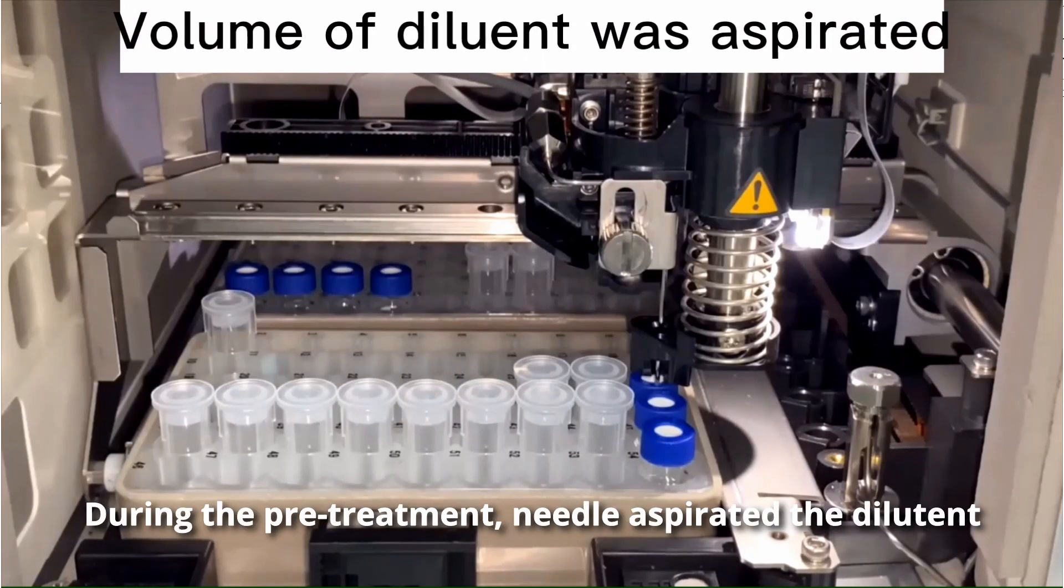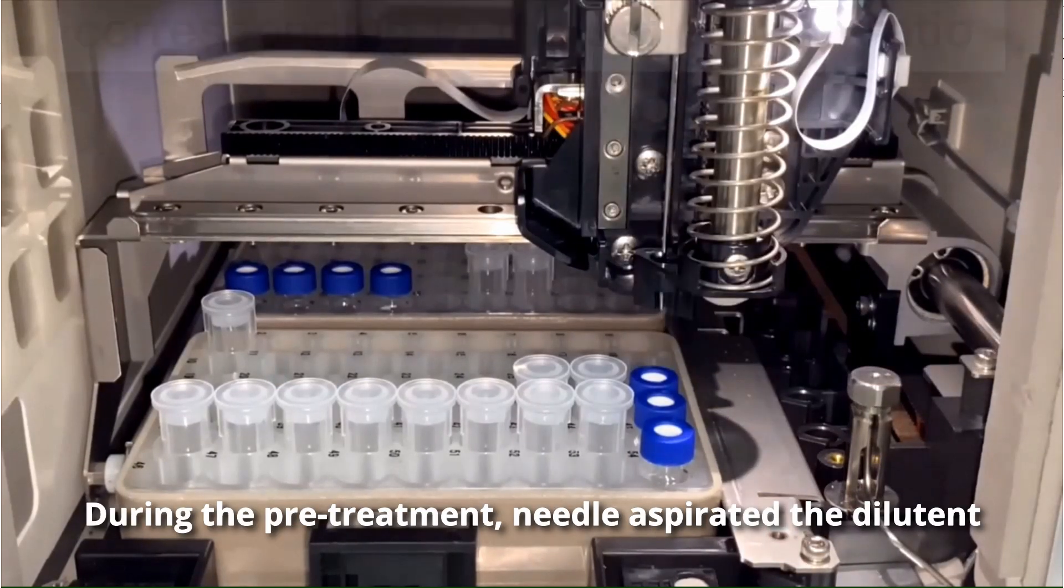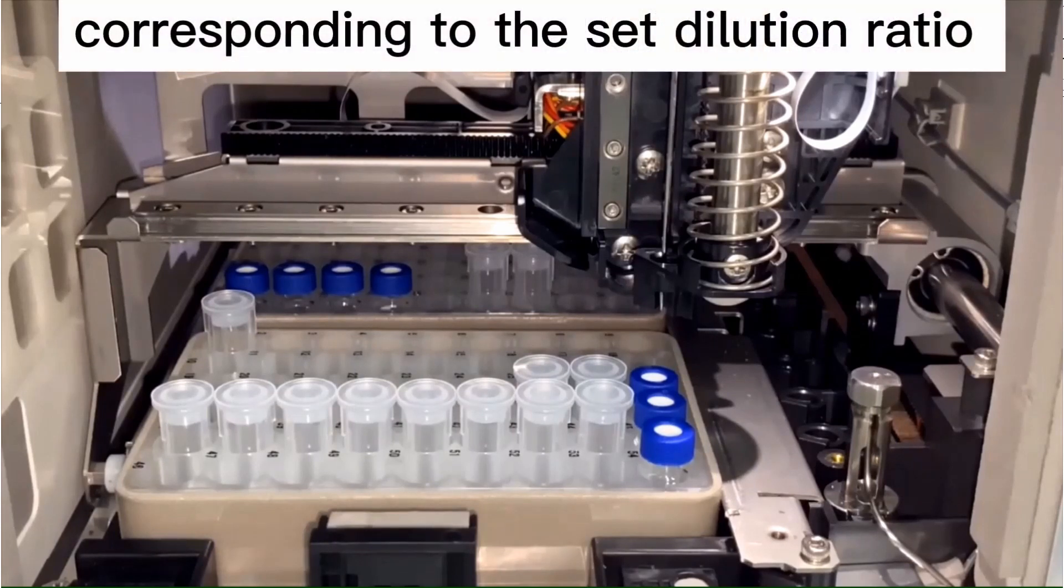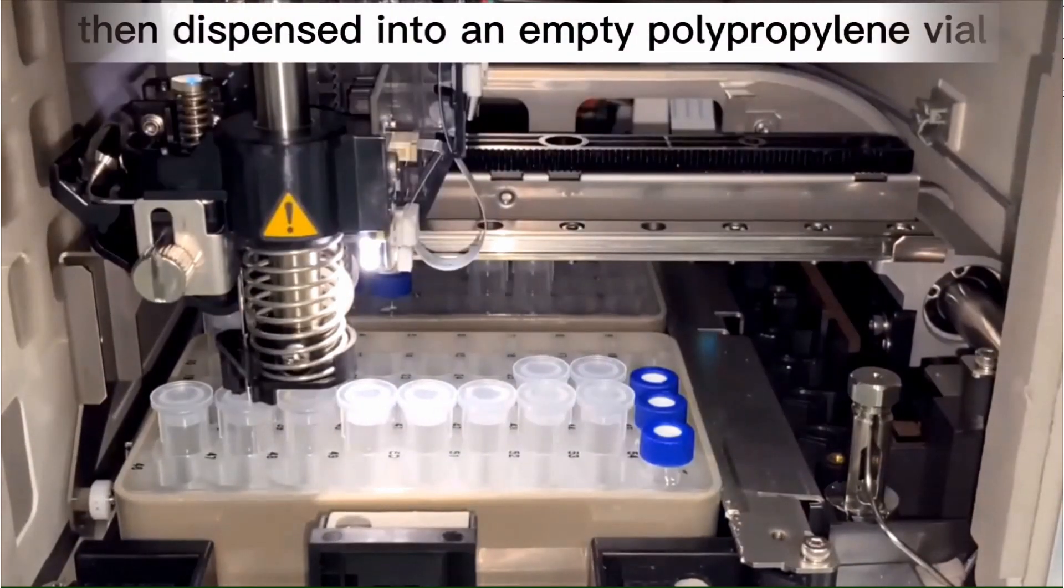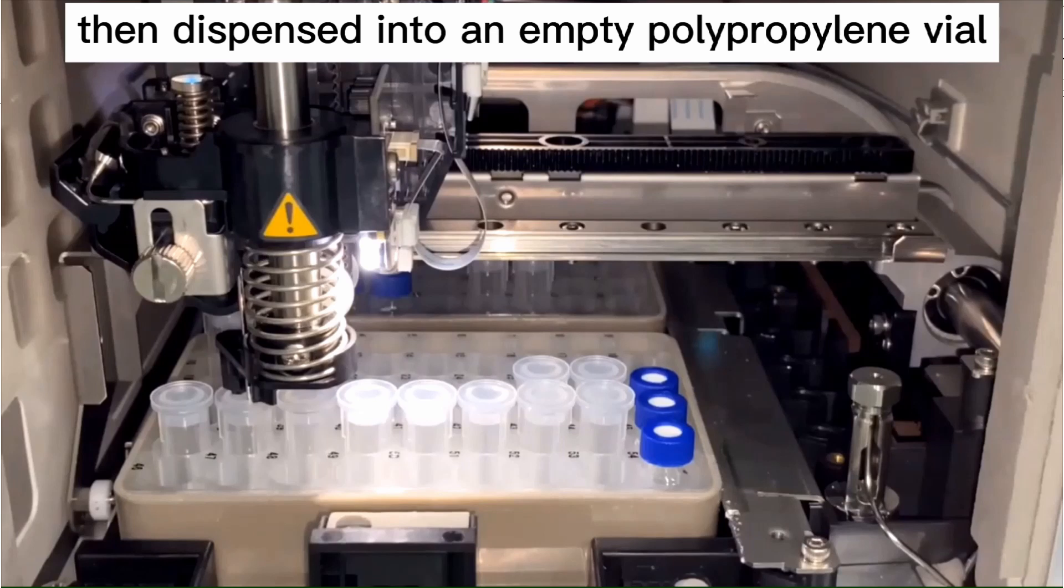During the pre-treatment, the needle aspirates the diluent corresponding to the set dilution ratio, then dispenses into an empty polypropylene vial.